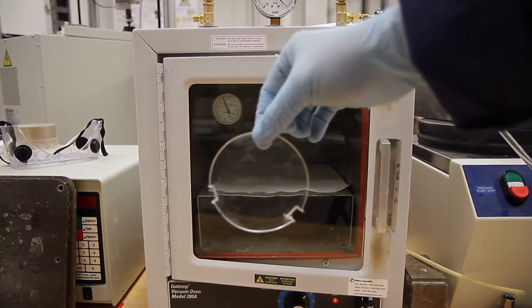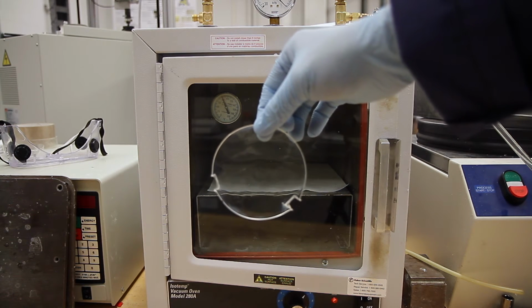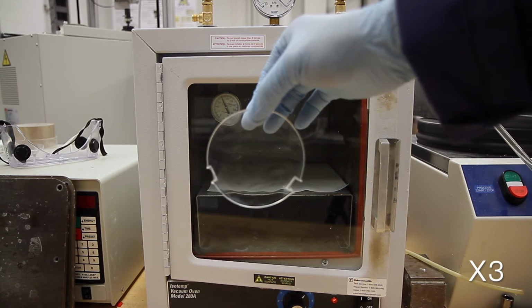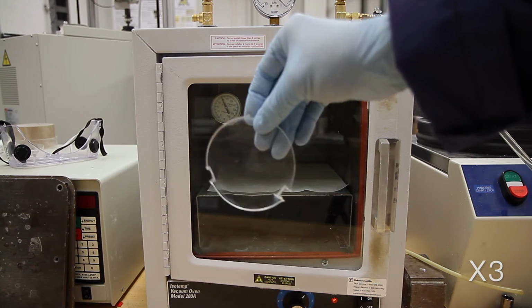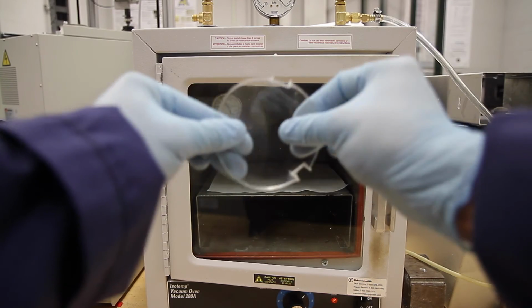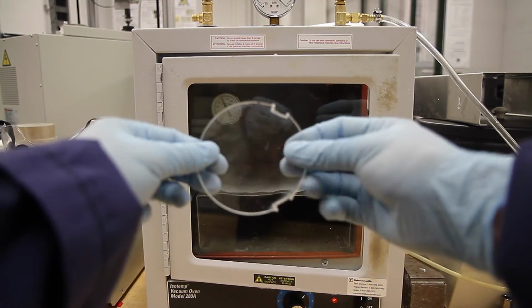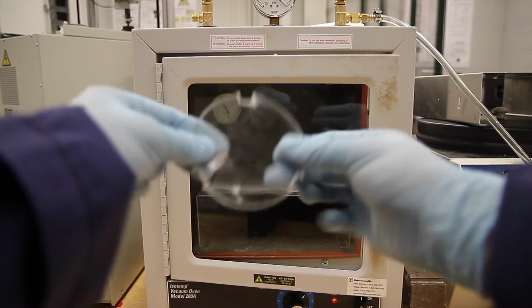It is still above its glass transition temperature, hence it is rubbery and flexible. I'll try to hold it flat so that I can show you the property demonstrated in the beginning of the video again. It is now stiff and glassy like a regular plastic. This sample has returned to the initial state.